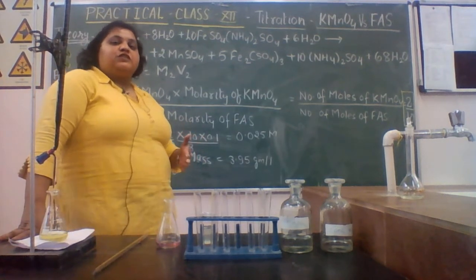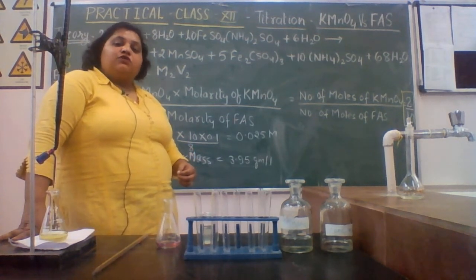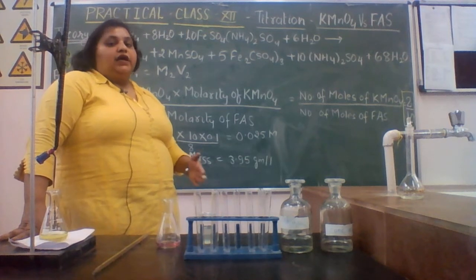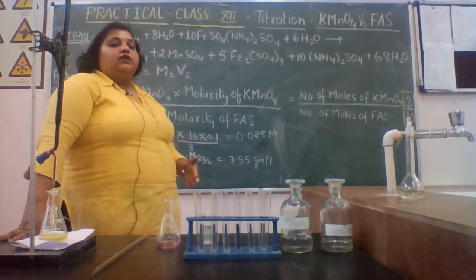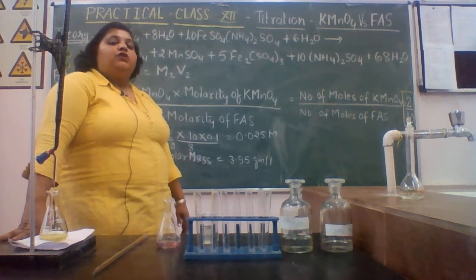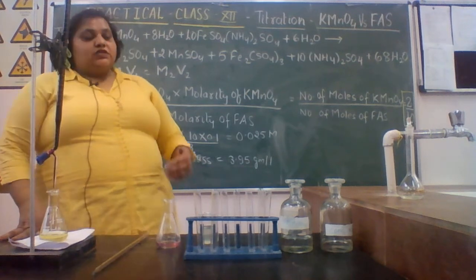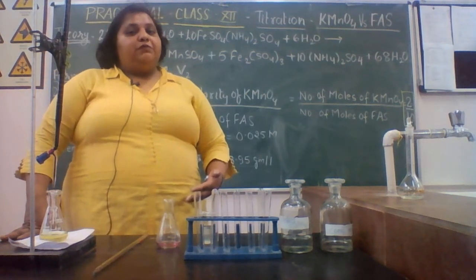Our first experiment that we have studied from the 12th class practical syllabus was the volumetric analysis, and two experiments are in the syllabus: titration of KMnO4 versus ferrous ammonium sulphate and the titration of KMnO4 with oxalic acid, right. I am just going for a quick revision of this experiment.